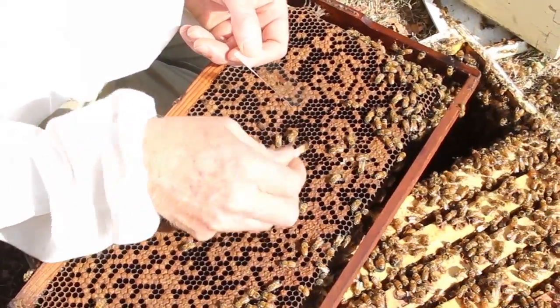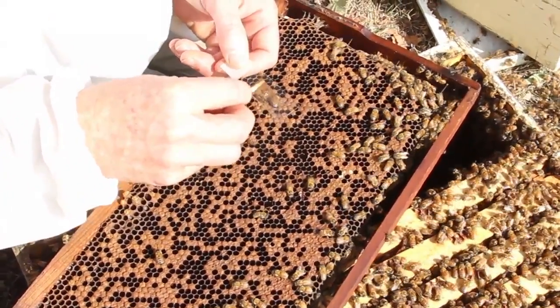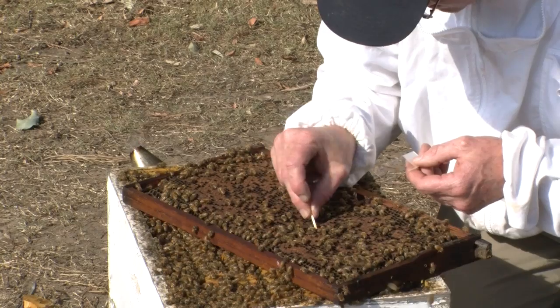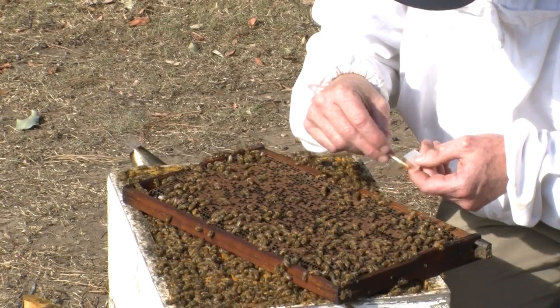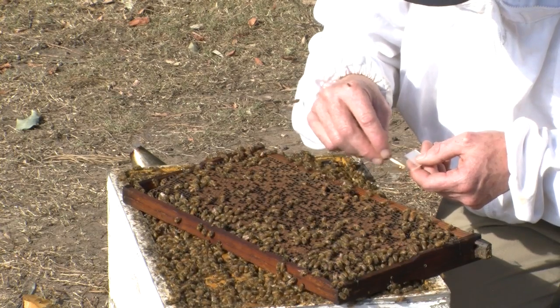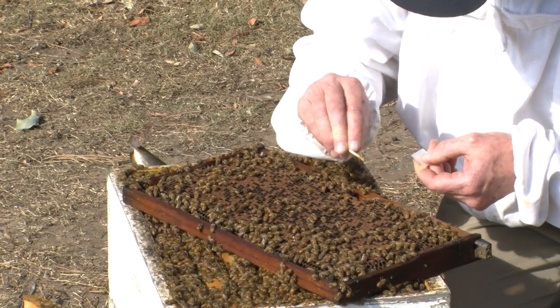It's important to get samples from more than one cell because you could have more than one disease in the same comb. We just mix that up on the slide and then wipe it off until it's very thin.